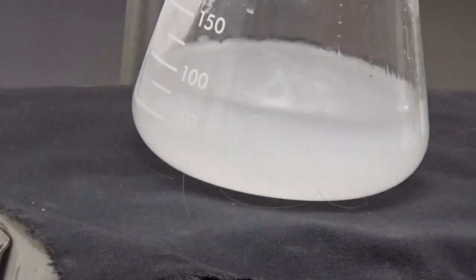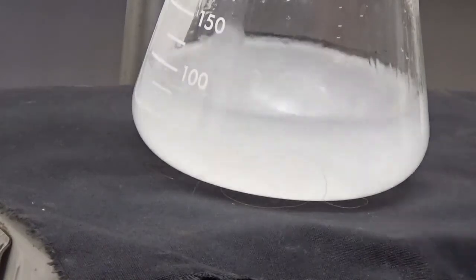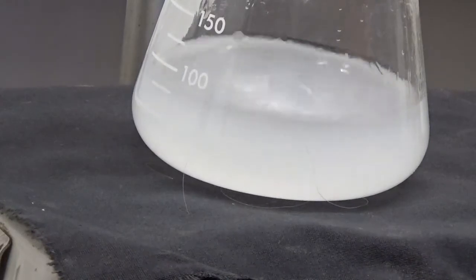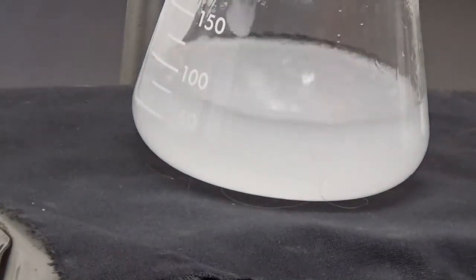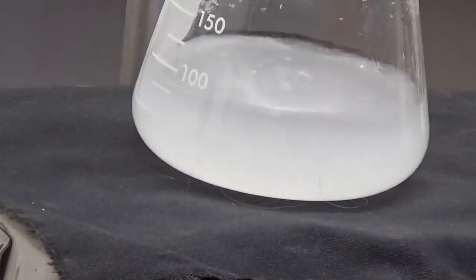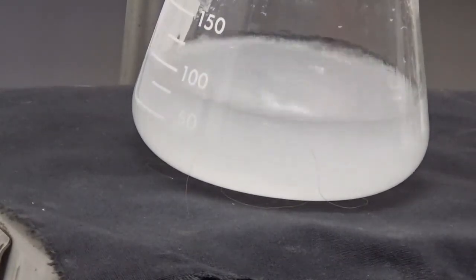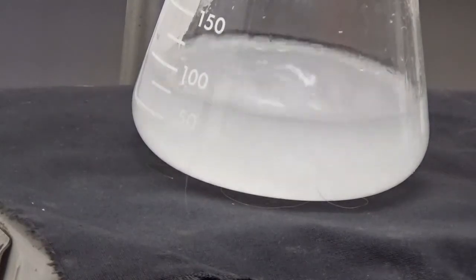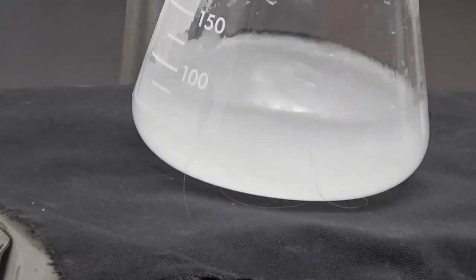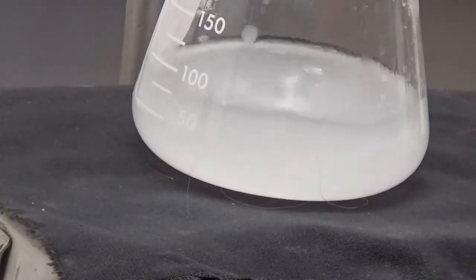Another bunch. It's quite a big bunch, but it's still cloudy. Because I added 10 mils of water this time, not 5. It was getting less and less each time. I was adding less and less acetic acid, but now I added a whole lot more water, so I'm going to have to add more acetic acid.